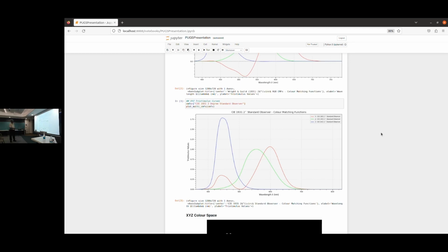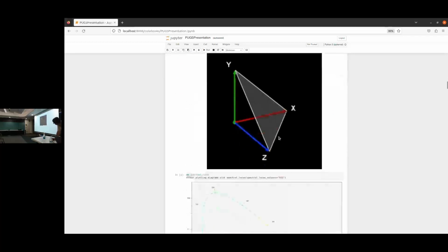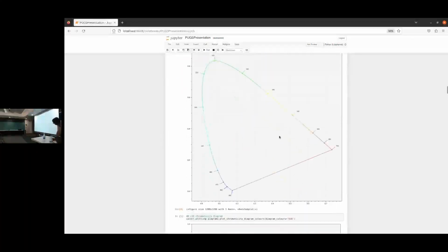But when we actually do some experimentation, you'll find that we have to weight it. And roughly, it has to do with the luminosity of the sources as well as response of the human eye to different wavelengths. So there's a weighting involved. Okay, so I think we have enough about color and measurement of color.